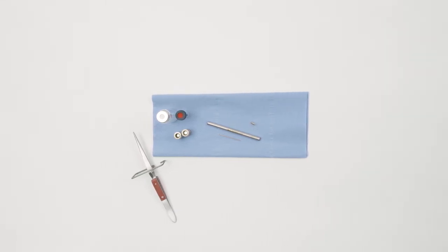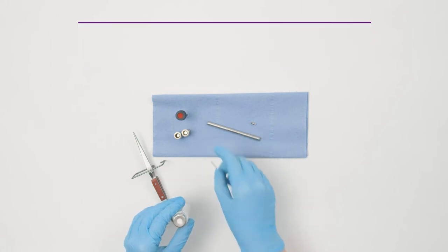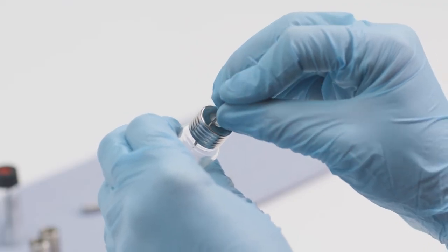ThinFilm SPEEME membranes can be used for both headspace and immersive sample extractions. Here we are using headspace sampling. With your sample in place, pierce the vial cap septum from the outer cap with a cotter pin and unscrew.